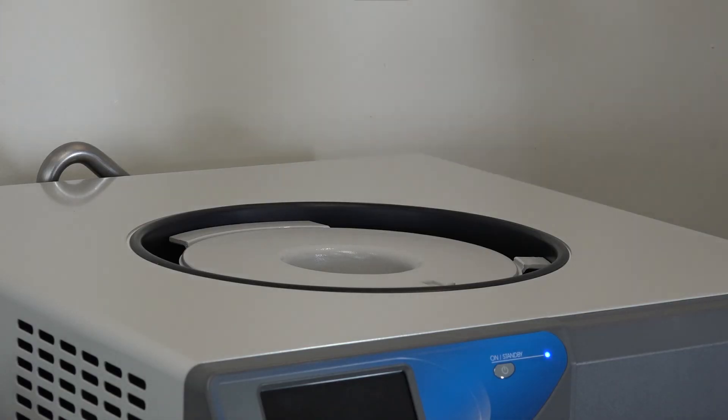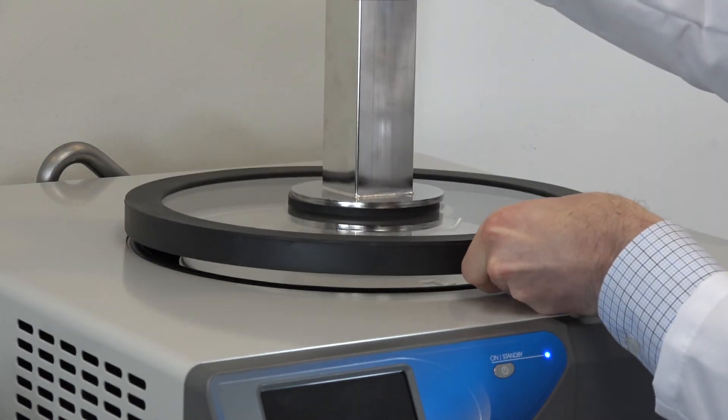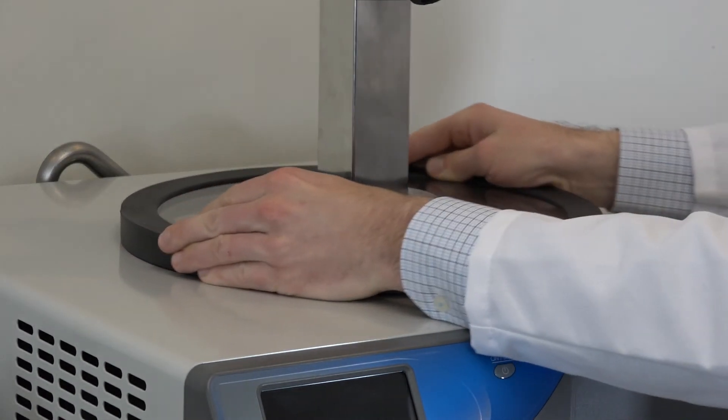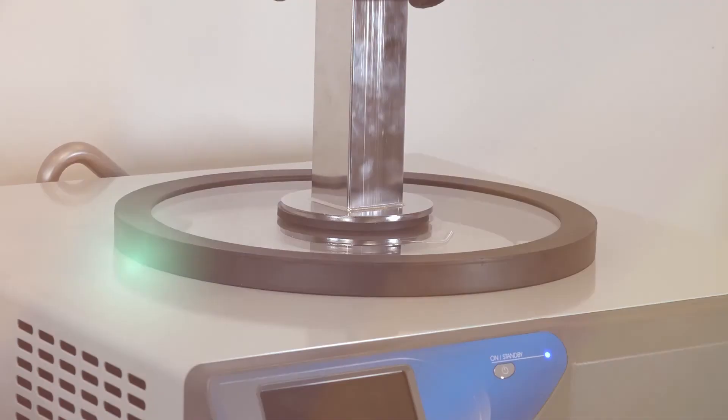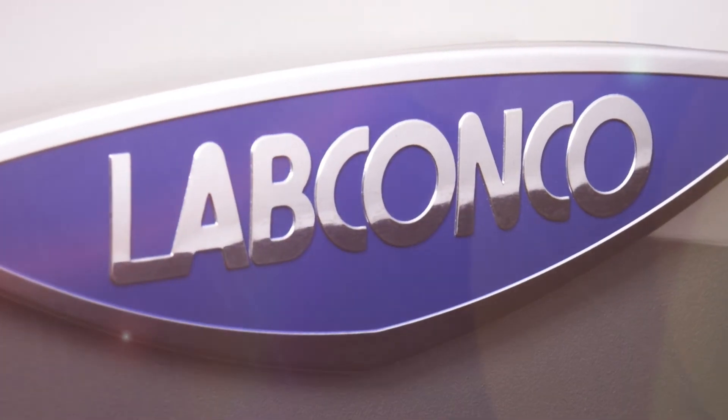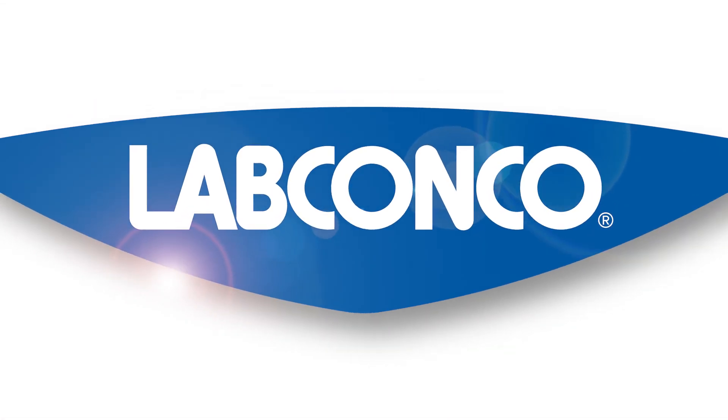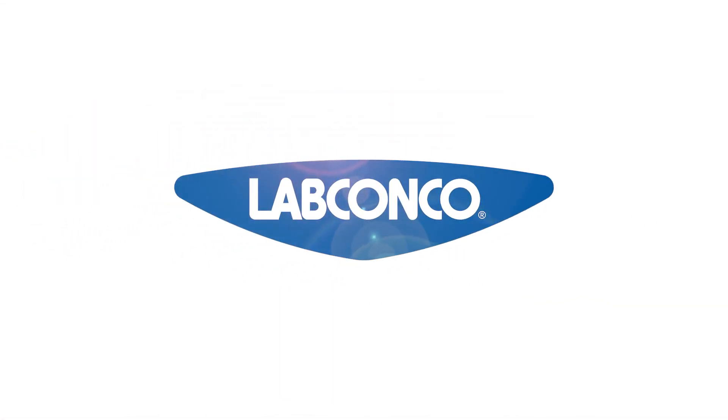Turn the completed assembly over and install it on top of the freeze dryer using the gasket centering ring to ensure that the lid is properly centered on the rim of the collection chamber. Installing a benchtop Freezone freeze dryer is now complete. Find out more about using your Freezone freeze dryer at labconco.com.